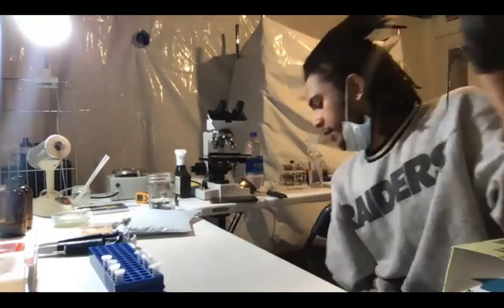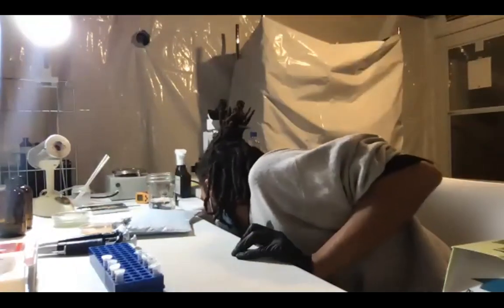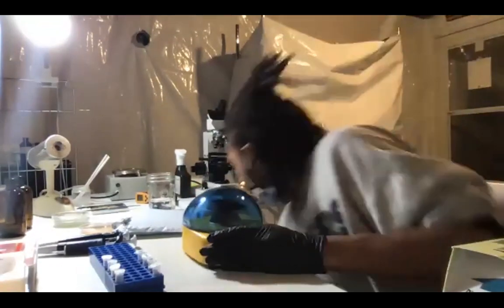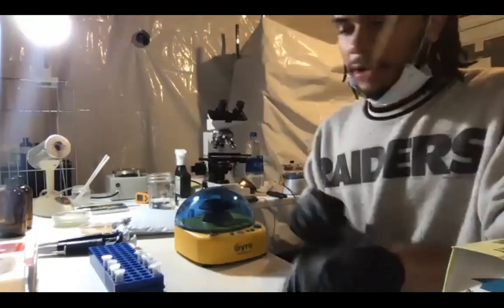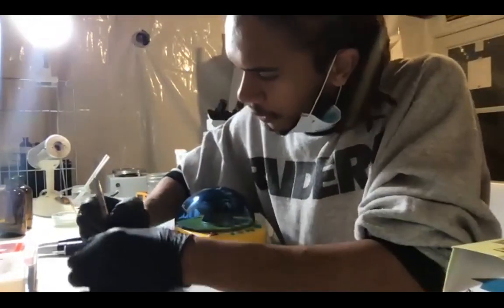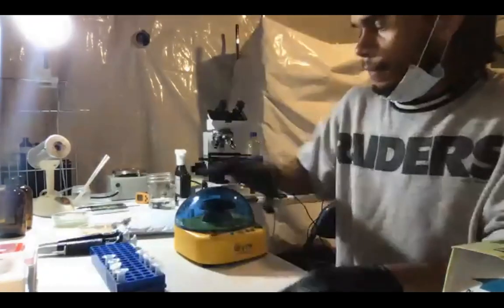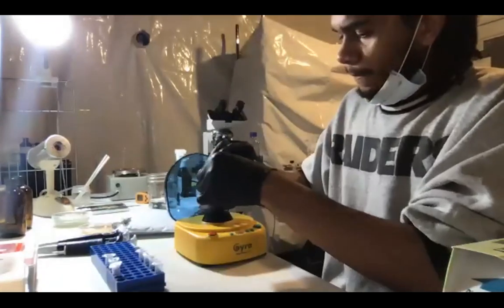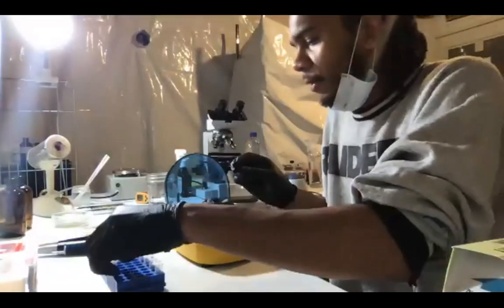Just to be sure, to make sure you're not wasting your time, I would centrifuge it for a couple seconds. This will really make sure everything's together. Before I put them in the centrifuge, I'm going to label them 1F, 1R, 2F, 2R. You can see there are still a couple droplets on the side. I want all that to be down at the bottom. Since it's such a small amount, one of those droplets could be the whole primer.